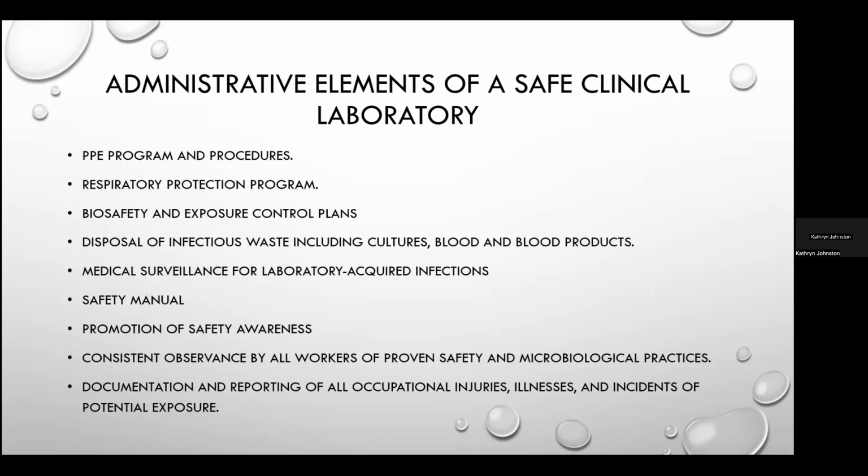The promotion of safety awareness through training programs and required adherence to safety procedures. I spoke earlier about the need to have a monitoring program going on. So in the healthcare arena, on the floors, they may be doing surveillance for hospital-acquired infections, but they also do monitoring of adherence to hand hygiene and other elements of standard precautions. And this is the same type of situation that the required adherence should be monitored within the laboratory. And then consistent observance by all workers of proven safety and microbiological practices.